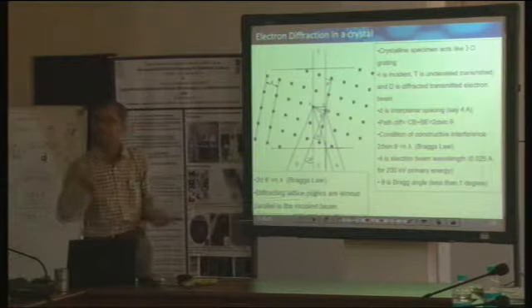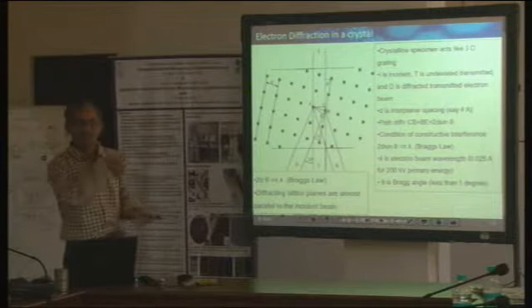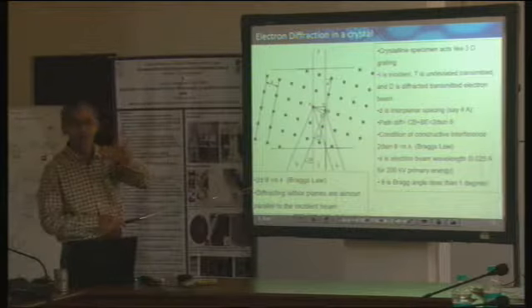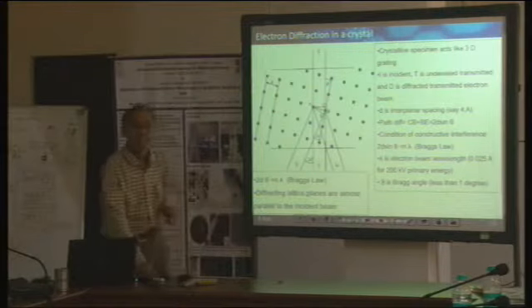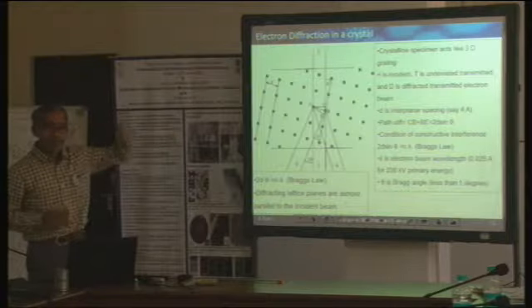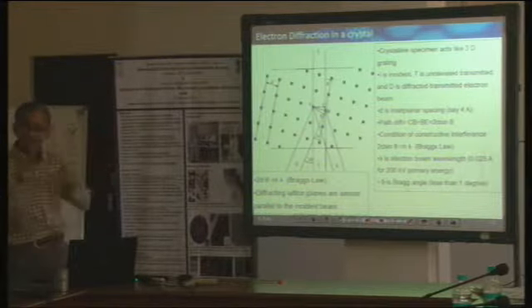It will be less than 1 degree, because 57 degrees is 1 radian. So ours has to be much smaller than 1 radian. No, not even 1 radian. It has to be much smaller than 0.01 radian, and therefore this theta value has to be less than a degree. What it means is that in our electron microscopy, we are working with very small angles.